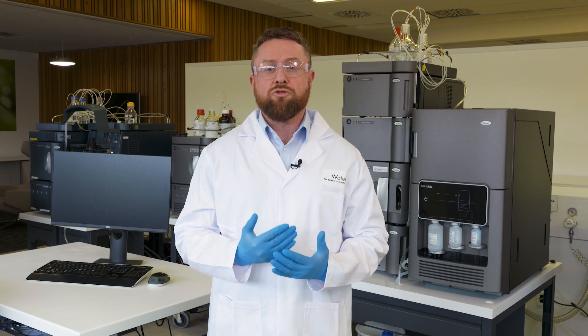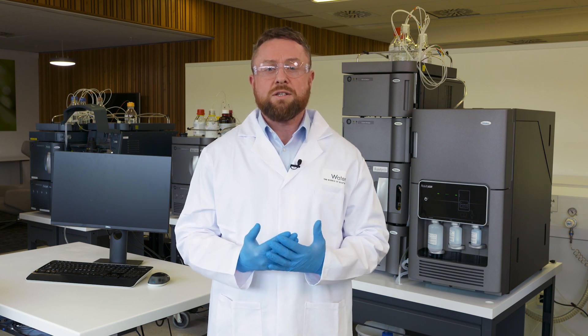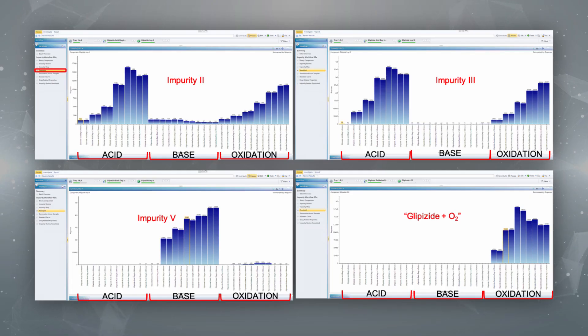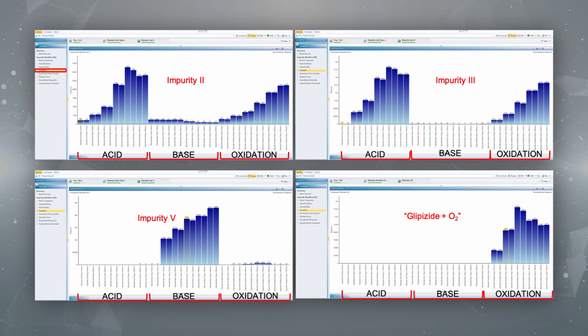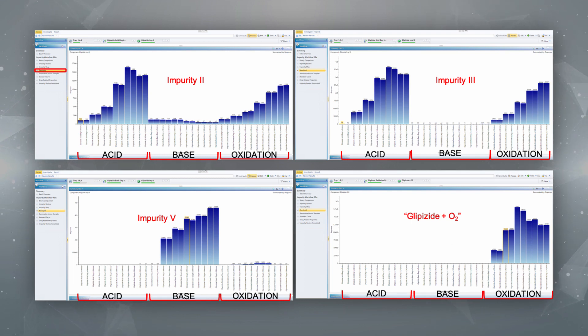The trend plot workflow step was modified to show the spread of impurity generation over all the time points tested, giving an indication of glipizide's relative stability at all stress conditions used. As can clearly be seen from these graphs, impurity 2 and 3 are generated under predominantly acidic and oxidative conditions. Impurity 5 exclusively under basic conditions, and an unknown oxidation product — tentatively assigned by UniFi as glipizide plus O2 — generated under oxidative conditions only, which we will now investigate further in the non-targeted section.